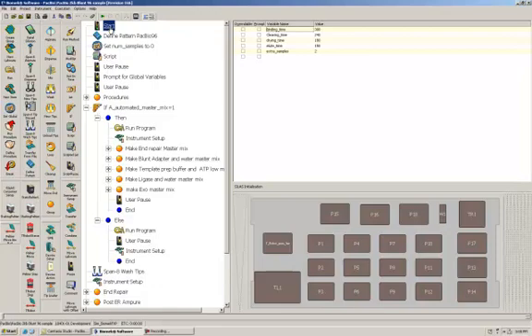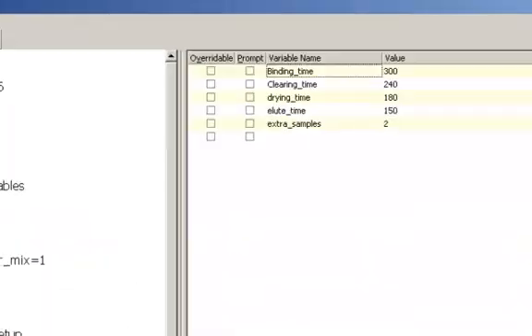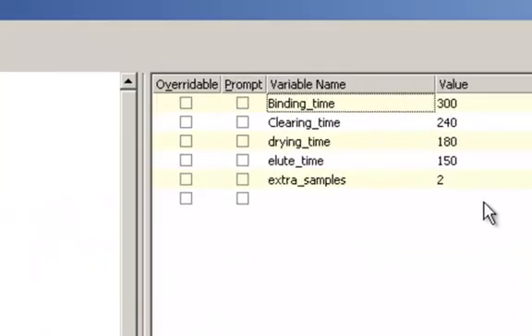Let's start with the start step. In the start step we have some variables. Most of them are ampere variables for timing delays. You got your binding time, your clearing time, drying time, and elute time. Those are basically in seconds the delay that's going to occur in the method.